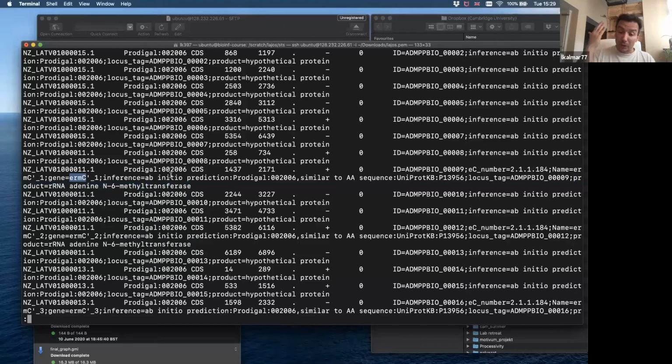So this is what you will get back, and it comes up from time to time that if you are using Prokka in default settings, it doesn't have the best resolution for all your species, one by one. So it is worth making your own Prokka databases.